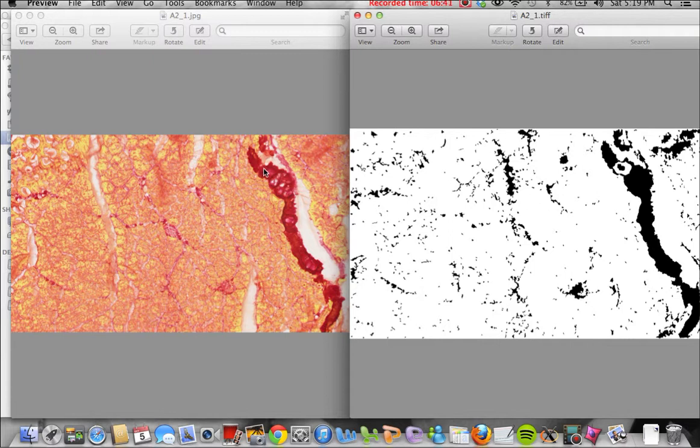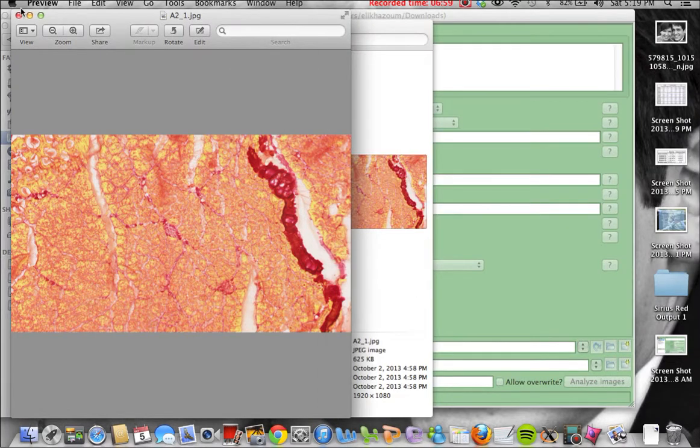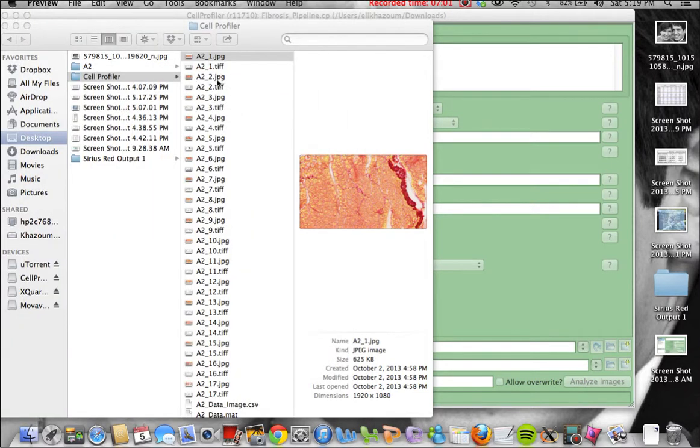So obviously this big red line here corresponds to this. You can see these little red swoosh areas going through here. Obviously there's black corresponding to all this. So this looks perfectly good, and I don't think we've seen any yet that don't look good, but just for the sake of consistency and accuracy, we have to check all of them.